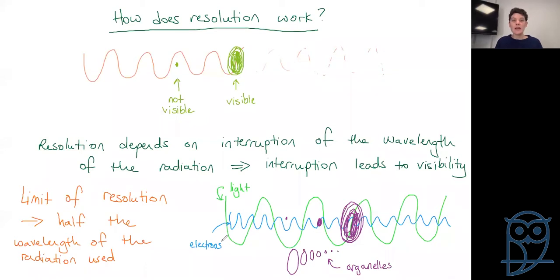So what we're saying is, irrespective of how far we zoom in, we're not considering magnification here. What we're actually considering is resolution, because that is our ability to then see something, to say, ah, there is a blob here, or there's just smoosh. So when we take that shorter wavelength of the electrons, then we can see things that are much finer detail, much smaller organelles. We can see cell membranes of 7 nanometers.